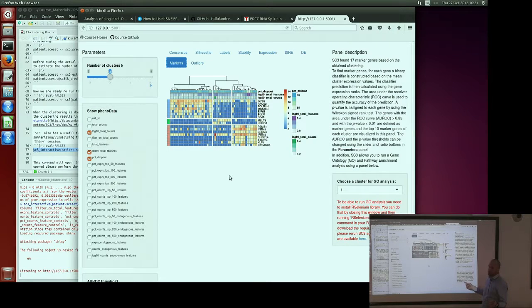You will need to install the R-Selenium package on your computer to be able to run it. But what it does is it only exports your gene list to gprofiler. So it opens it in a separate web page, and then you can run it in gprofiler. So it's quite convenient when you don't want to copy-paste the gene names.